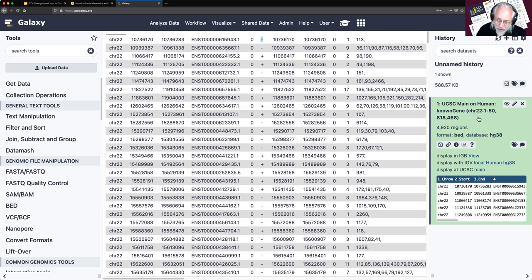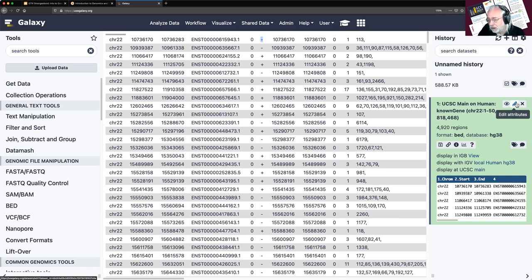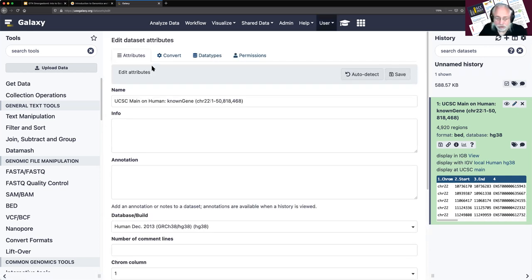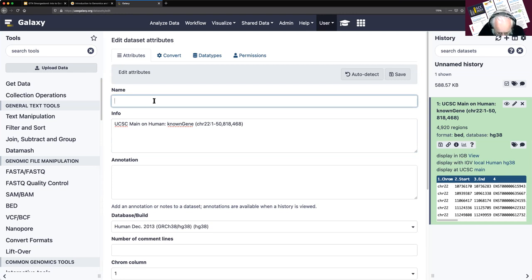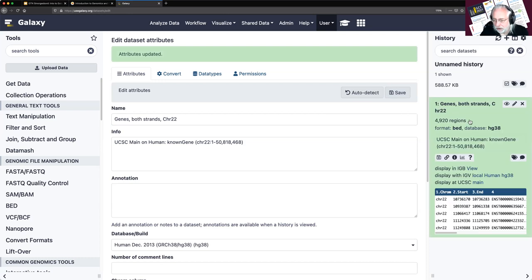Before we start our analysis, there are a couple of best practices. One is we probably want to rename this dataset. Everything in the current name is true — it came from UCSC main, it's about human chromosome 22 genes — but when I come back a week from now it's not very helpful. So I clicked on the pencil icon, moved the old name to the info field, and gave it a more meaningful name: 'Genes, both strands, Chr22.' Now when I come back, I know what that is.